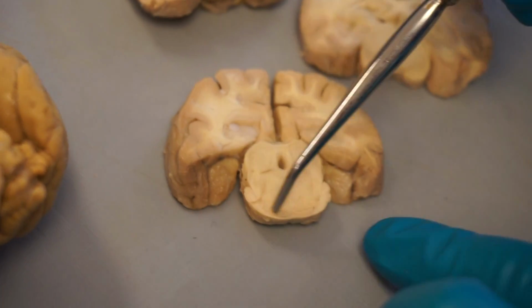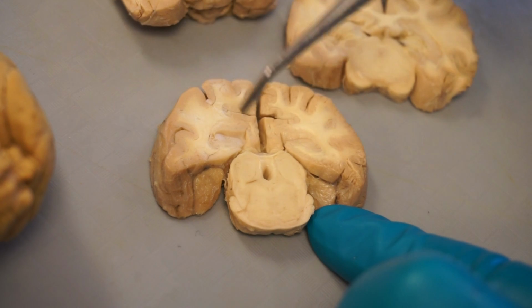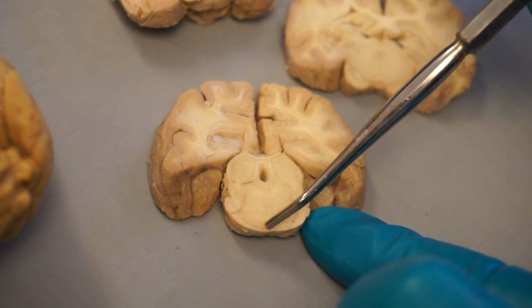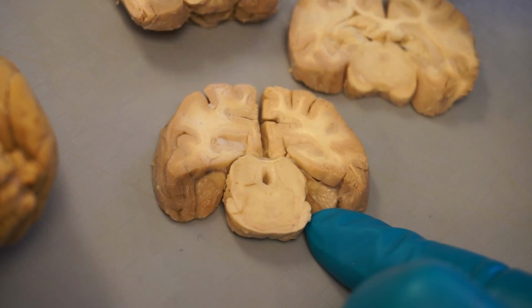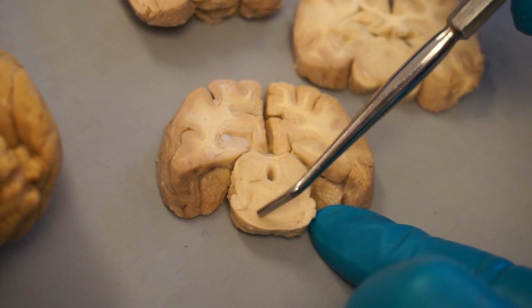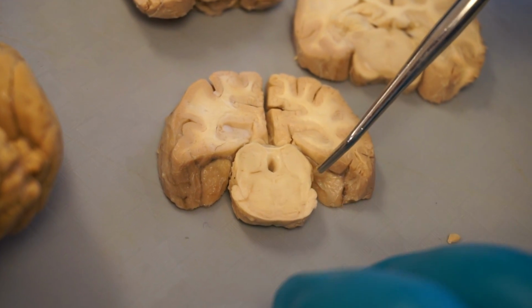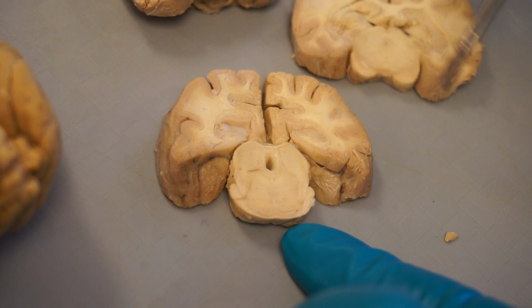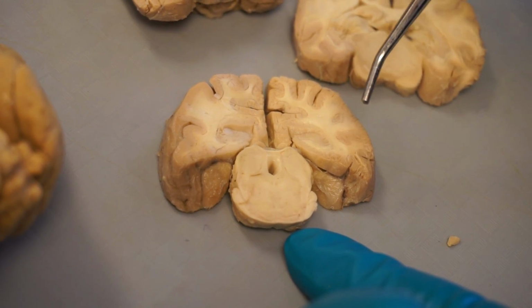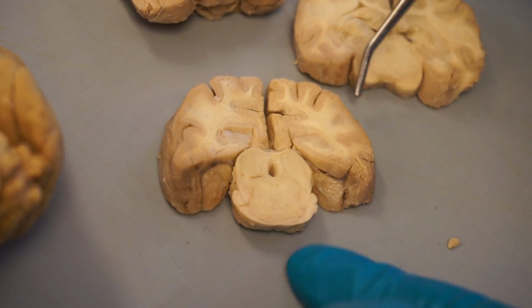The pons and the cerebellum are part of the metencephalon. These fibers coming around here would be transverse pontine fibers. It's hard to see here, but there will be longitudinal fibers of the pons that would have been the continuation of the crus cerebri tracts as they head down to the spinal cord.